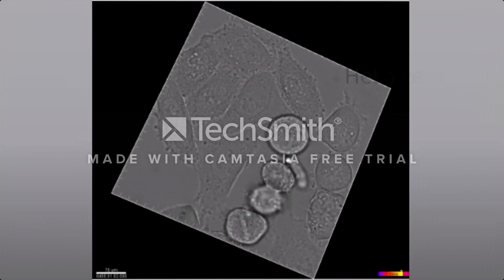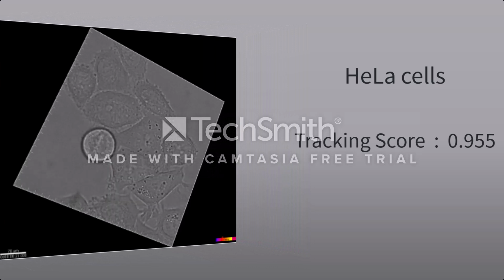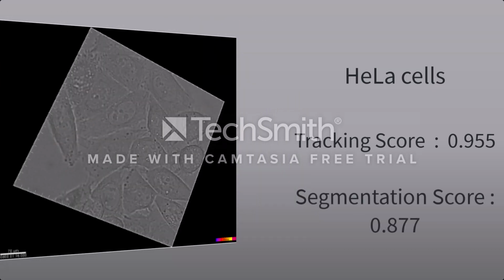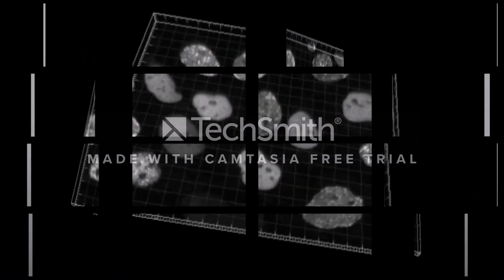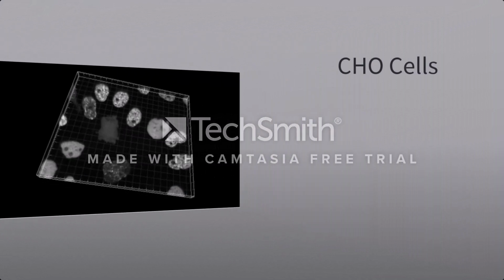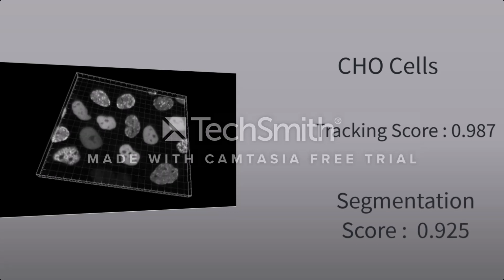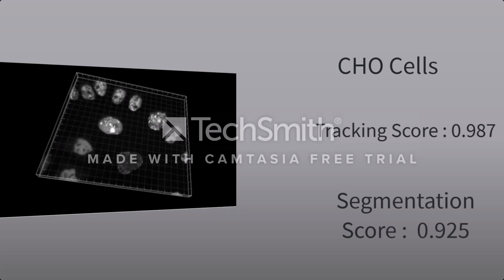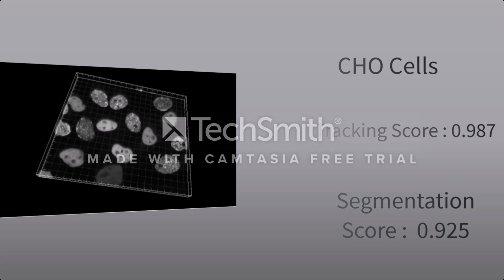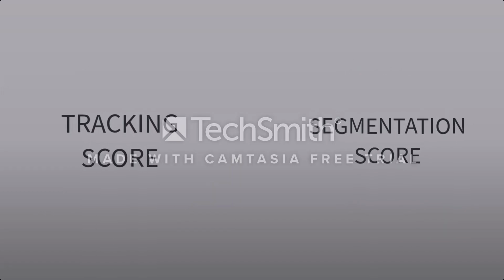For the HeLa cells, an average tracking score of 0.955 was observed, and when tested it with segmentation benchmark, a score of 0.877 was obtained. Similarly, for the CHO cells, the best obtained scores of tracking and segmentation benchmarks were 0.987 and 0.925 respectively. A lower score here would indicate that either the algorithm does not generalize well or the ground truth data is not consistent.